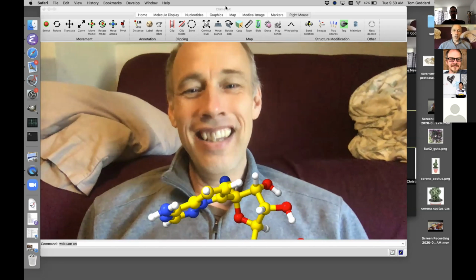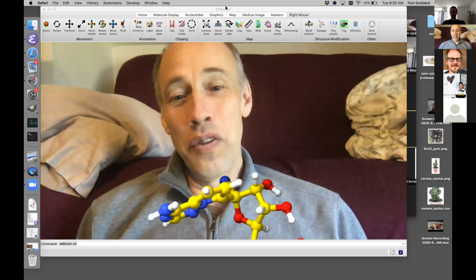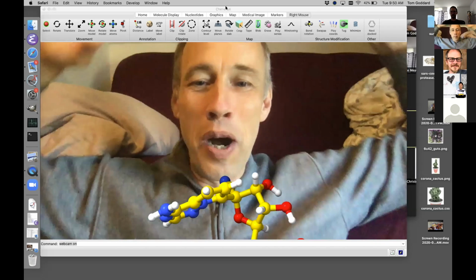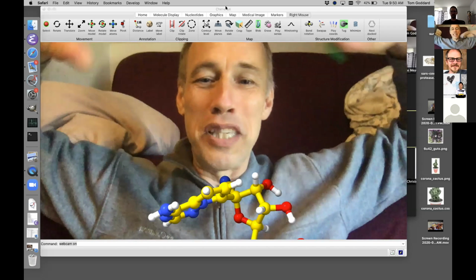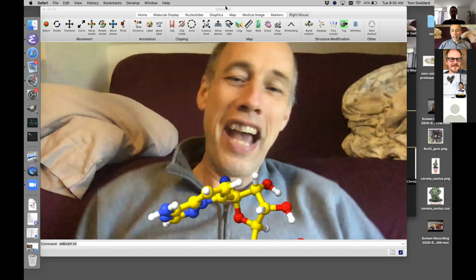In this, no, ChimeraX can't do that right now. Like Zoom does that, right? You can add some background. You don't want people to see your messy house and your cat and things. So I can't do that right now.